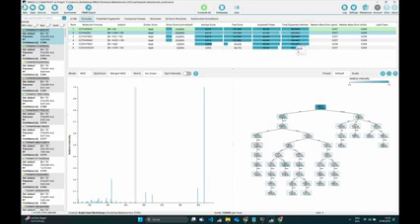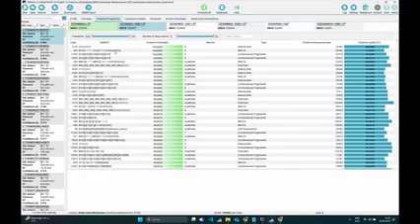So maybe as a number to know, you want this, of course, to be as high as possible, and if it's above 80%, it's always a good sign that the fragmentation tree fits well to your data. Okay, I am not going to go to the other columns, but now we have the formulas which have been identified, and the second thing we will look at is the predicted fingerprints.